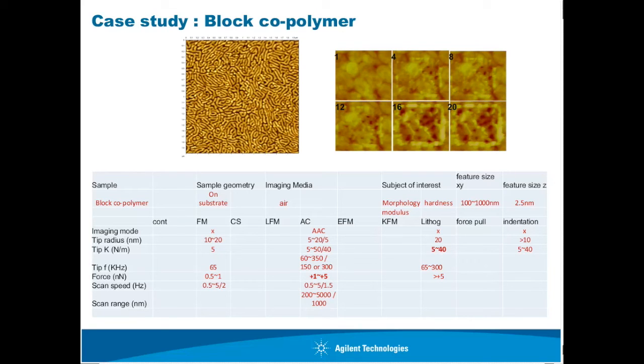Here's contact mode. That's the reason I do not suggest contact mode, because as you scan with contact mode, you actually gradually destroy and wear your sample down. The sample is changed.